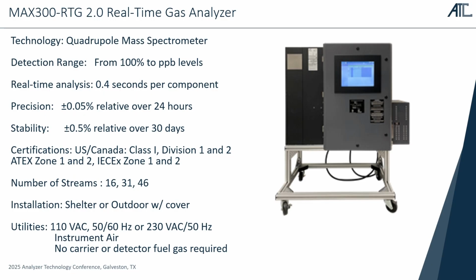So wide dynamic range makes it good for doing carbon capture. The second thing, which I've already kind of hinted at, is that a mass spec as a technology can measure many different components. So there's no class of compounds that is invisible to a mass spectrometer. So if you have a long list of impurities of different chemistries, mass spec's a good generalist technology to use.